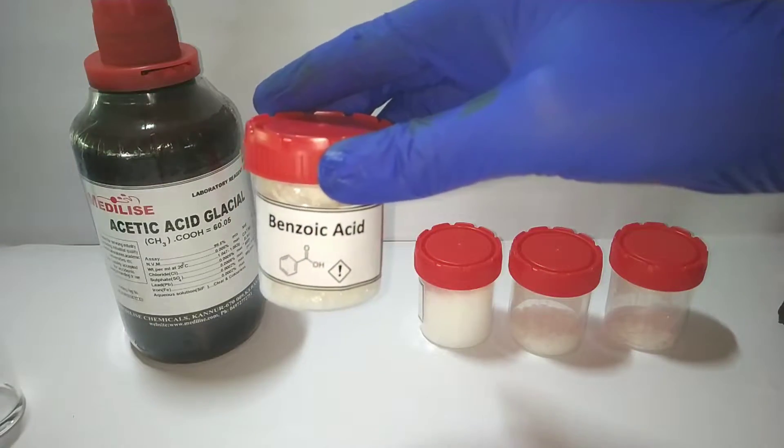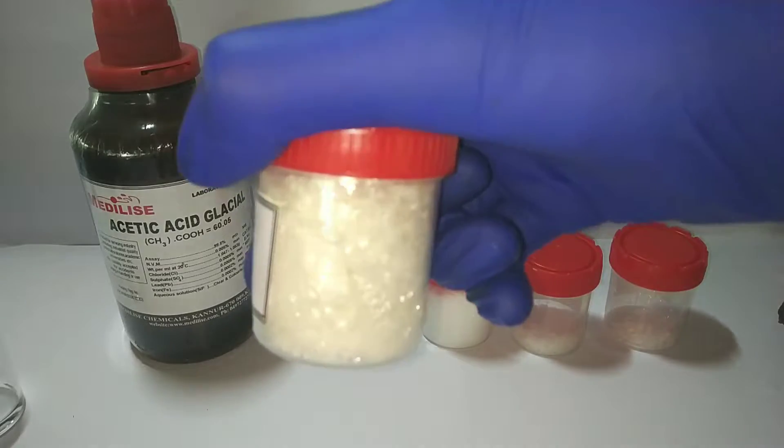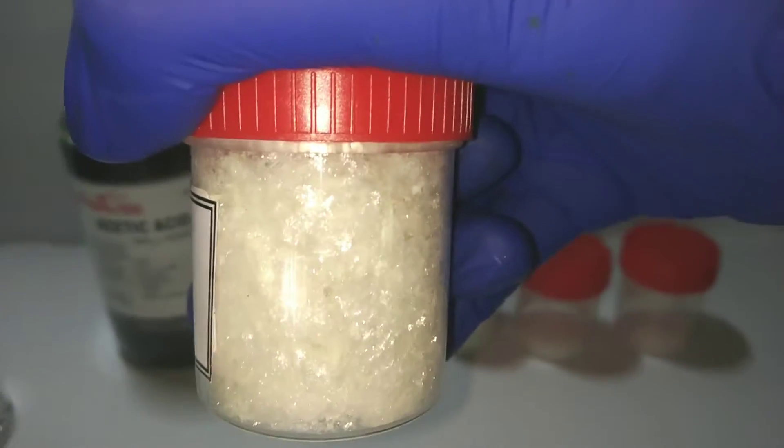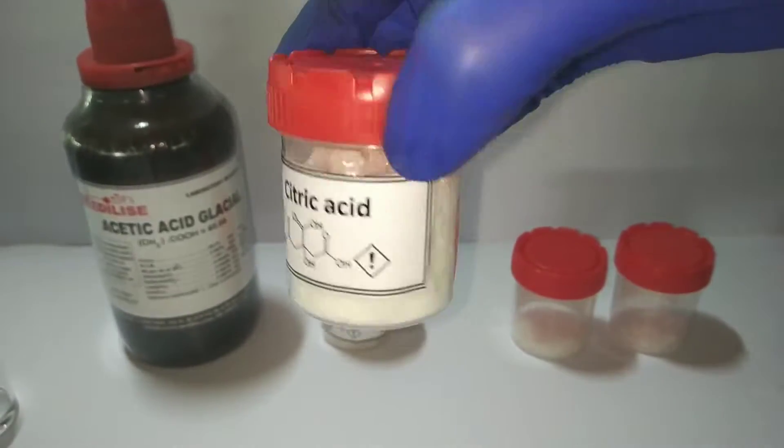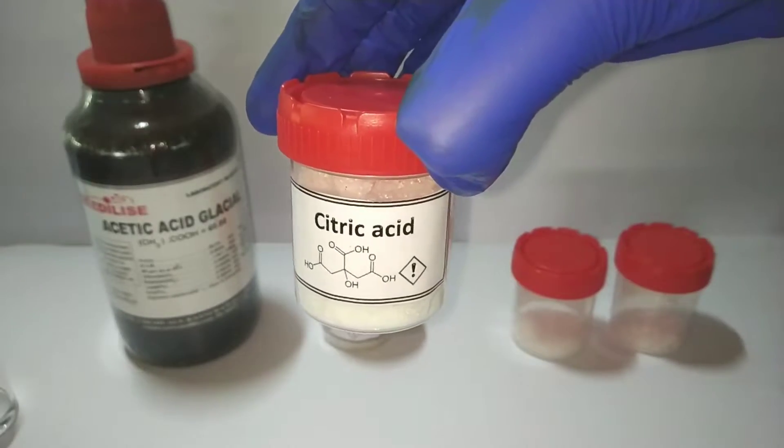For aromatic carboxylic acids, the simplest is benzoic acid. I have a synthesis video of benzoic acid—you can check the description for the link. This is citric acid, commonly available in grocery stores.